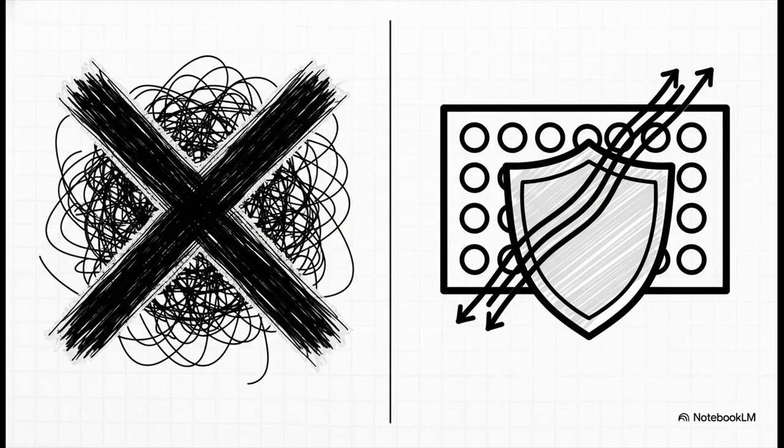Yeah, you heard me. It's physics. More often than not, the real culprit isn't some random mistake you made. It's systematic bias. It's the predictable physical forces that are acting on your plate every single time. And here's the best part. Once you understand these forces, you can design your experiment to make them practically disappear.